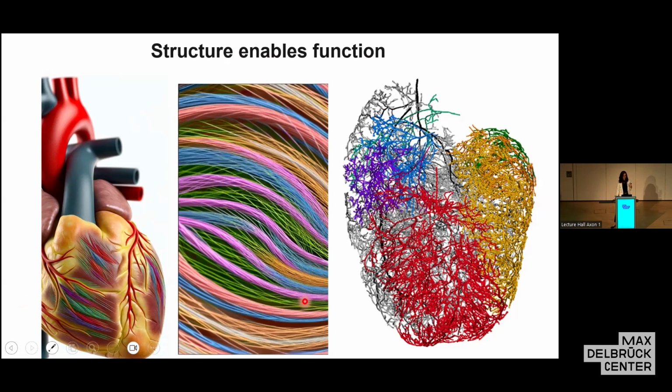But we want to take individual cells, make sure they're elongated, they're aligned in parallel, and that when they contract in unison, so we can measure the shortening and the force of contraction. But that's just one type of structure.